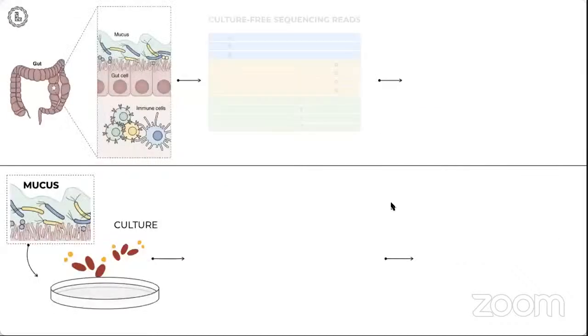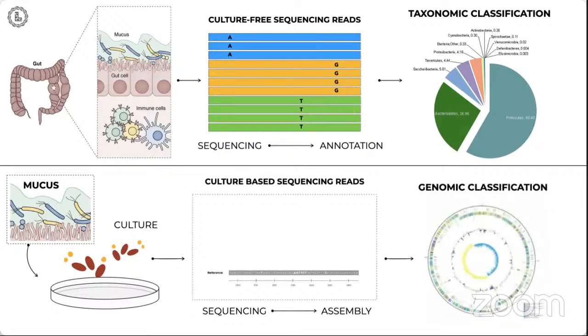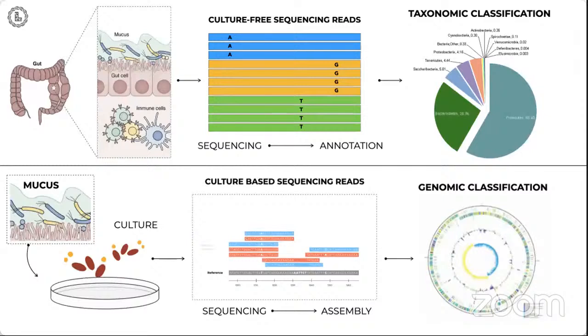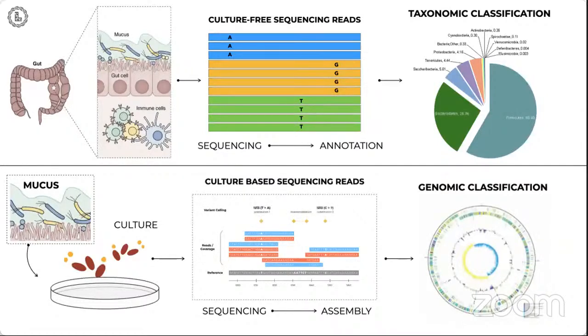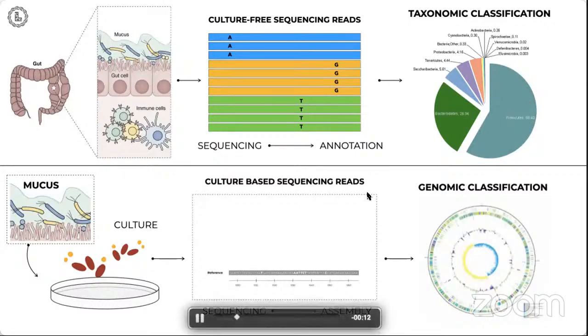So this sequencing can be applied to any culture-free environmental population, as well as to any detailed extraction of microorganisms that can be characterized with or without culturing in labs. Oftentimes, in order to gain a complete understanding of selected microorganisms, these techniques are combined. First, an exploratory metagenomics approach is applied to a culture-free sample, and then selected microorganisms are grown in laboratory culture to explore and verify the hypotheses generated from the metagenomic sequencing or these culture-free sequencing techniques.